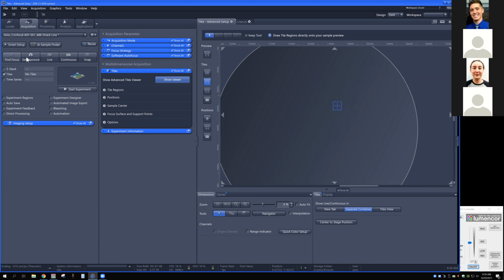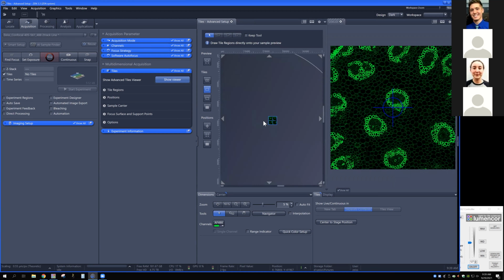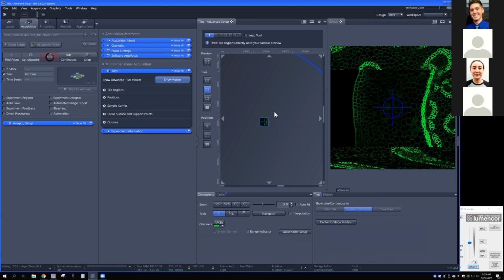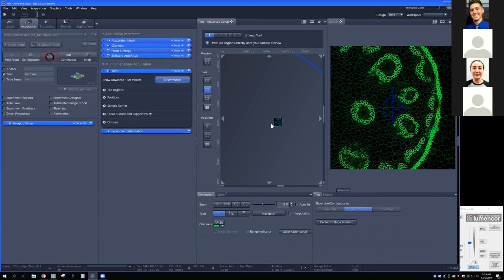I have to say my favorite way of doing this is to use it in a separate container. This is going to let me show side by side my live window plus a little preview here. And this is really nice because then I have access to all of the different focus tools that I showed you yesterday. I have access to all of the double clicking and the edges that I showed you yesterday as well. So the navigation tools in live are fully available. Also I can make big jumps here by just double clicking around the stage area. So I can make jumps in the tiles window as well, which I find is a really nice way to transition between the two.